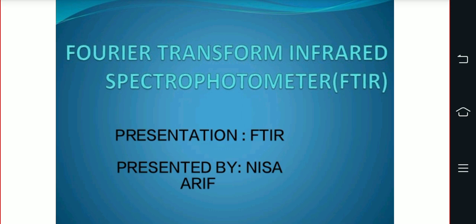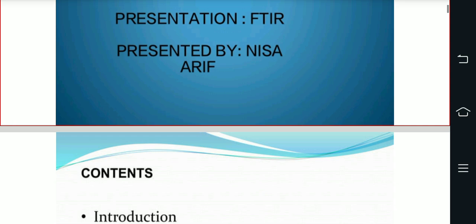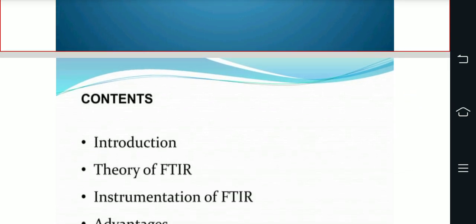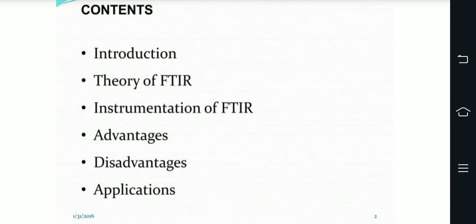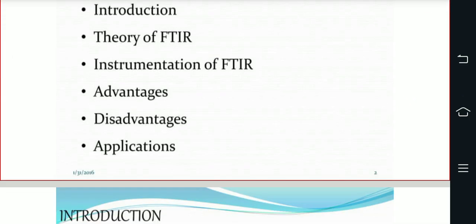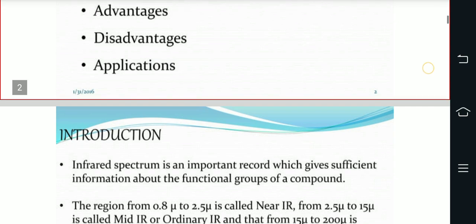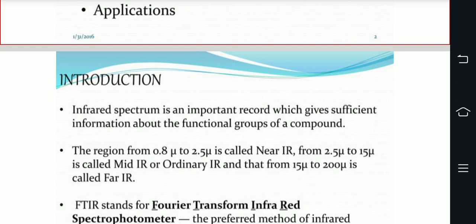So today we will discuss it. Let's get started. First of all, here are the contents. Number one is introduction, theory of FTIR, instrumentation of FTIR, advantages, disadvantages, applications. First of all, we discuss the introduction.